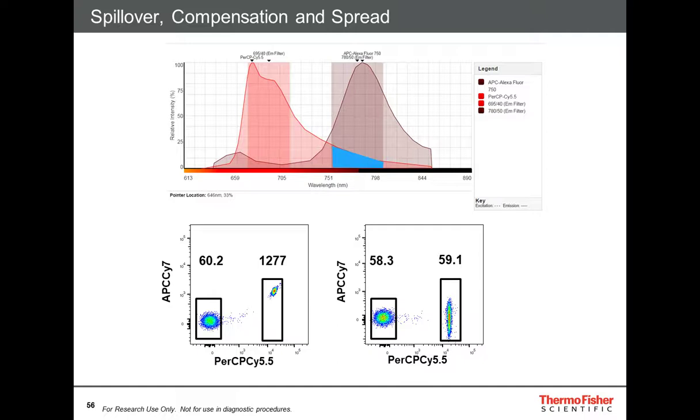We use compensation in our single stain sample to adjust these medians to be more equivalent, and we have a fully compensated sample. Now, when this cell gets a value here and this cell gets a value here, I can't change that value. I can only bring it down to the lower end of the log scale, and now I visualize this spread. It's not visible here because it's on the high end of log space. It's much more visible here. This is what is called spread or spillover spread. I don't really like those terms, but we're kind of stuck with them. So that's what you see here.